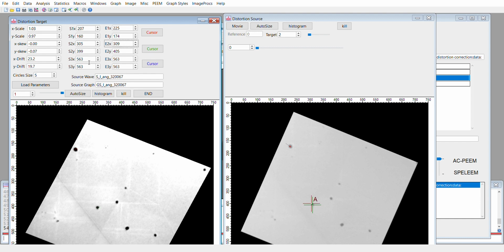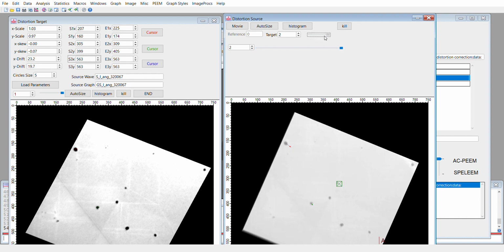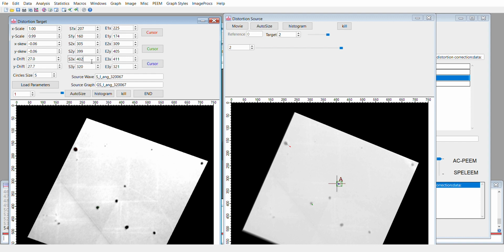And then you go to the third point, you activate interface, and okay, we got this dot. Okay. Then we press cursor here, enter here, and we check the result.